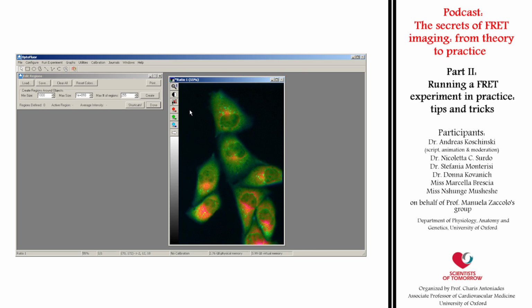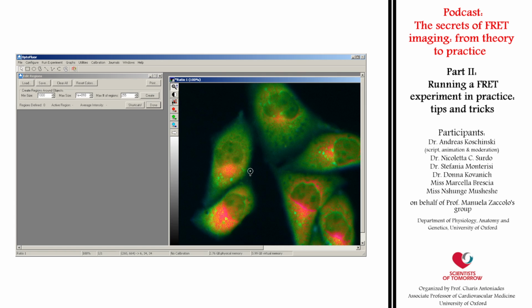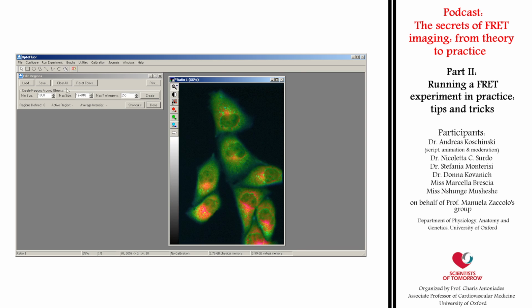Press it and open a rectangle over your region of interest by right-clicking and dragging. If you magnify it too much, just use the mouse wheel to get back to a lower magnification. To see the cells better, you can also increase the brightness of the picture with the slider at the side. Now open the Region tool by pressing the respective button. I always use region 1 as the background region.